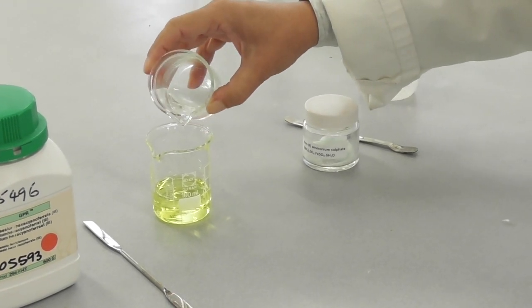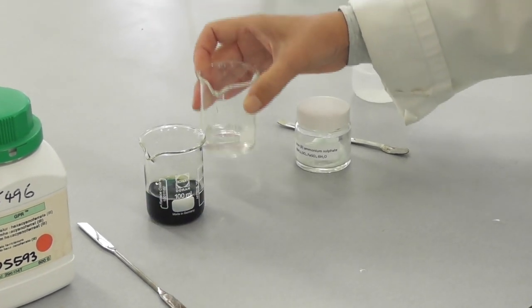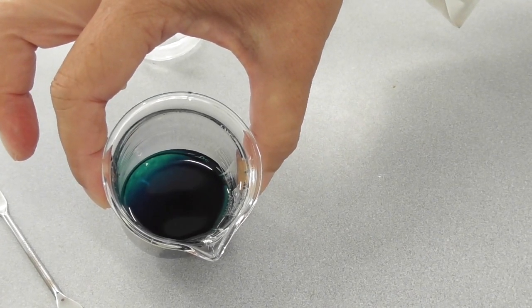As soon as I add a drop of one solution into the other, a very dark precipitate is formed, which seems to be black but it's really a very intense blue.